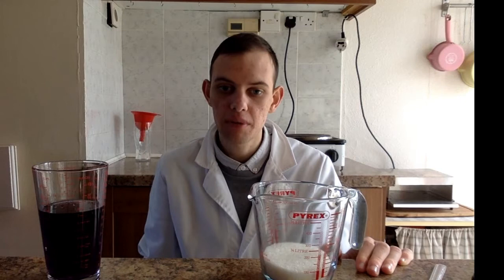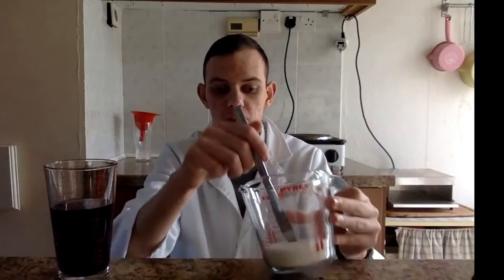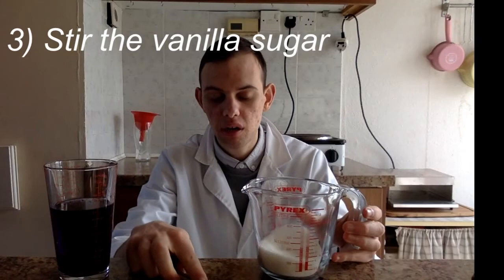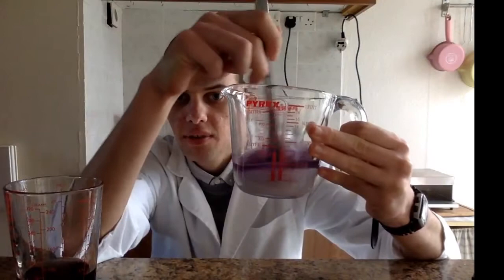Let's get into our experiment. The first step is to measure out our two ingredients. Over here I have measured out 120 grams of vanilla sugar, and in my other beaker I have measured out approximately 200 millilitres of methanol. To begin with, I will only be adding 100 millilitres of the methanol into the beaker with vanilla sugar, and I will stir it for a few minutes to make sure all the vanilla sugar comes into contact with the methanol so that the vanillin gets dissolved.